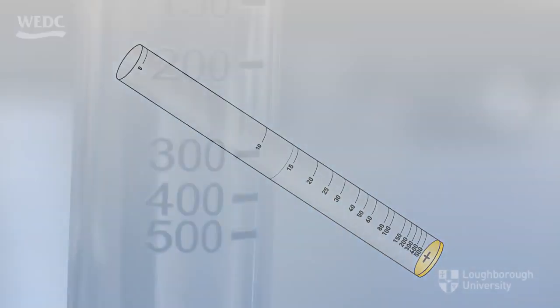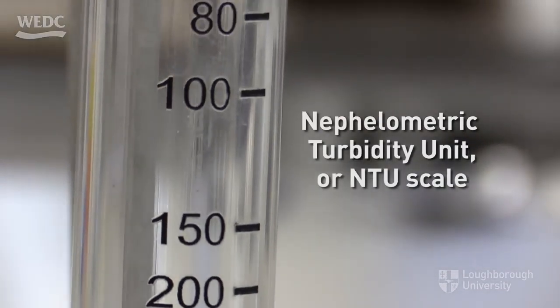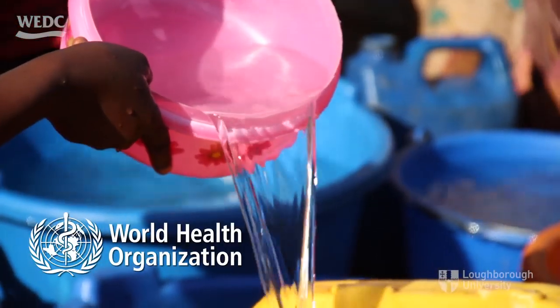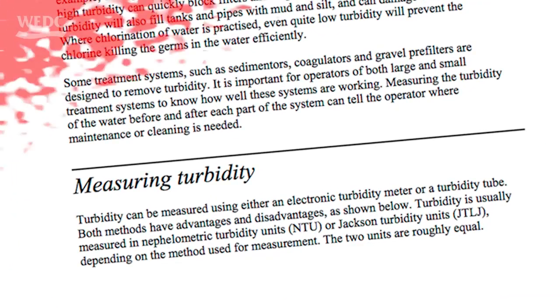A typical unit of measurement is the nephelometric turbidity unit, or NTU. There are other units of measurement, but we use NTU here, as WHO make recommendations for drinking water quality based on the NTU scale.